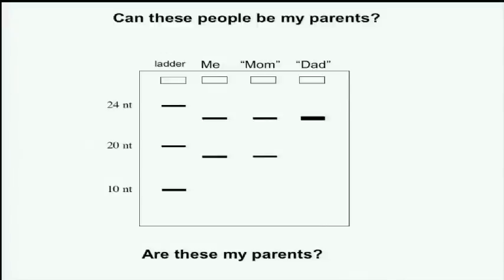Welcome back. Let's answer the questions that we were just discussing. Does this gel show, are these people my parents? Can these people be my parents? Well, the answer to can these people be my parents is yes.